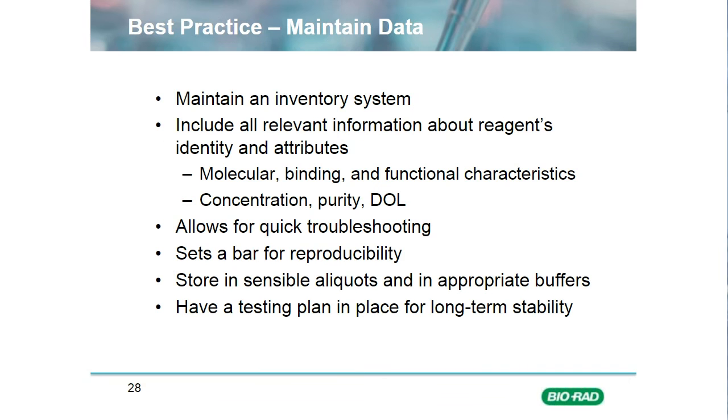Some other best practice considerations: obviously, maintain an inventory system. Think about how you will both plan and maintain your inventory, and also think about how your supplier might be part of this, since they can hold stock or maybe dispatch material from the same lot to different sites if you have a multi-center study or are working in parallel with a CRO.